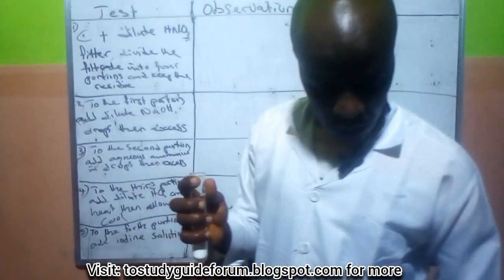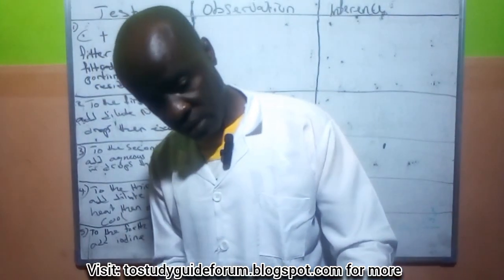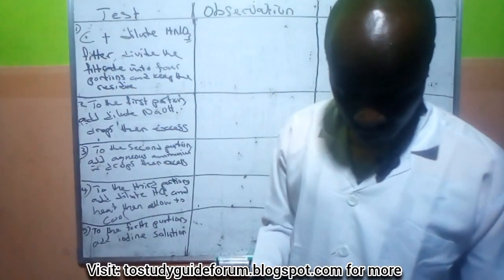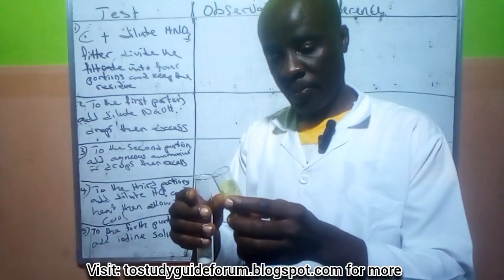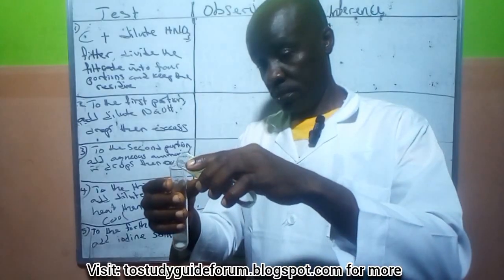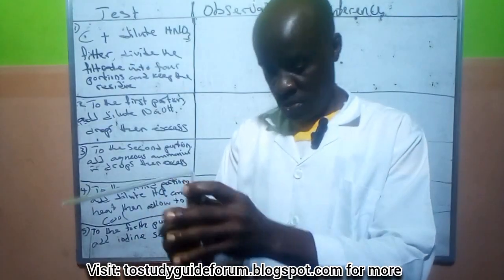Then add the dilute nitric acid. Remove everything. Observe this going on here. This gas will go away.